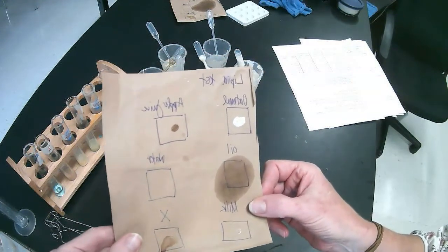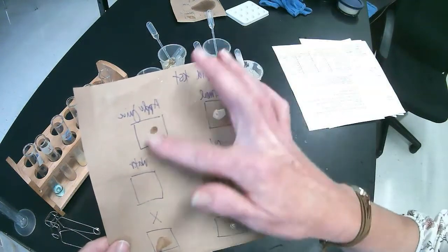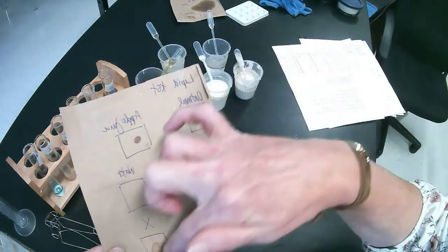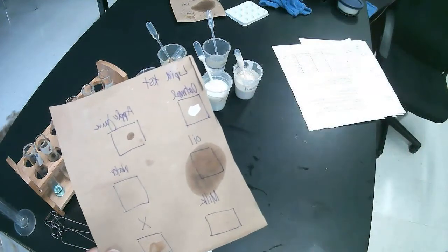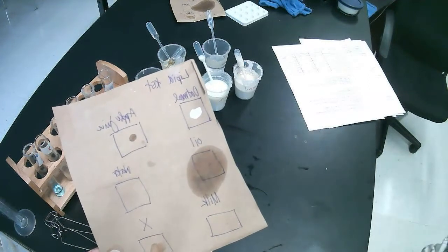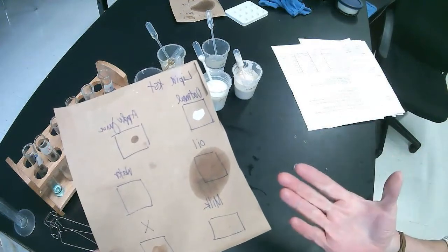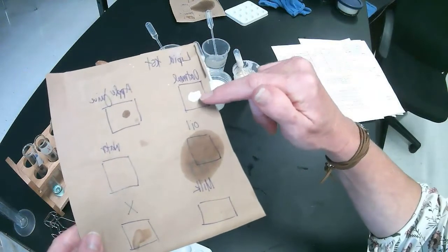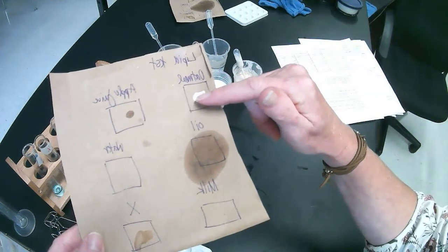That's okay. Okay. So for the lipid test, how we decide if something is positive for lipids is you put a drop in the middle of each box and label it, and then you let it dry. And once it's dry, if you see a smear outside of the original drop, that means that the paper has absorbed lipids. Again, lipids is fat. So this is a grease smear test. So oatmeal, the oatmeal just dried on there and there's no grease smear. So oatmeal is negative for lipids.